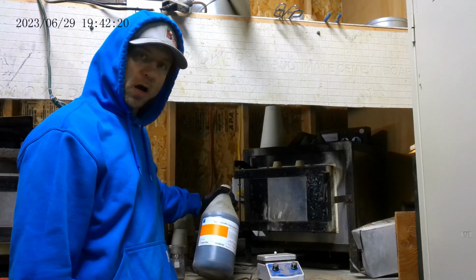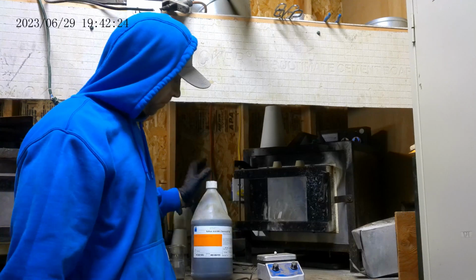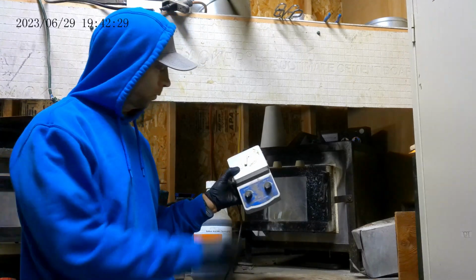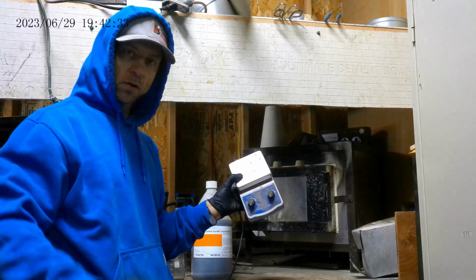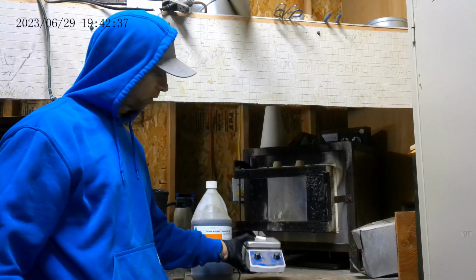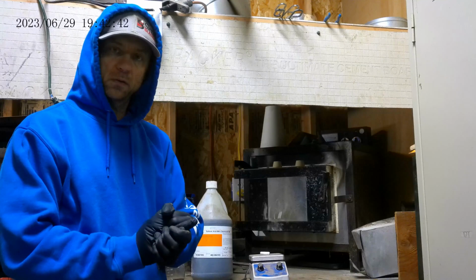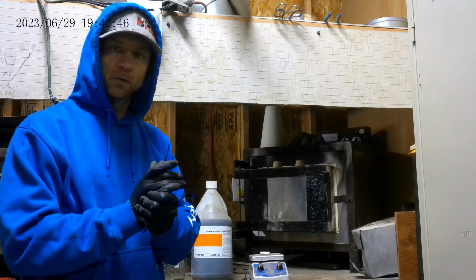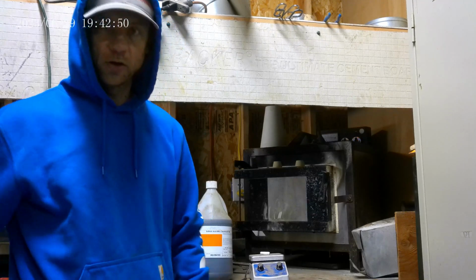I've got some concentrated sulfuric acid here, and I'm going to put it in there. I've got my hot plate with magnetic stir. You put this in the bottom of the beaker, turn on the heat, and it spins this magnet in there and keeps it stirred. So we're going to use that and see if that pre-treatment will make a difference in our recovery in the smelt. So I'll readjust the camera and get started here.